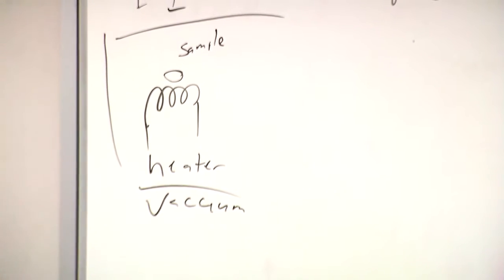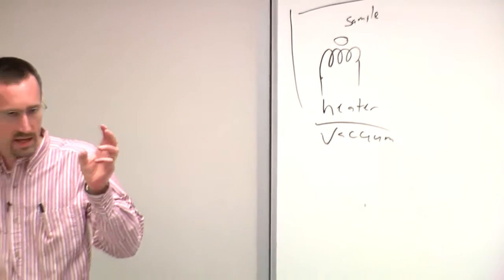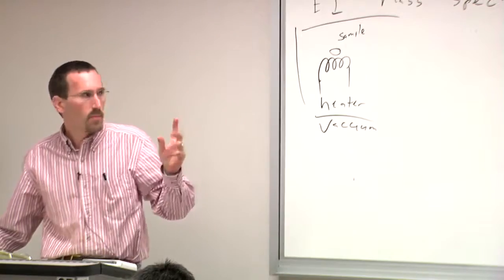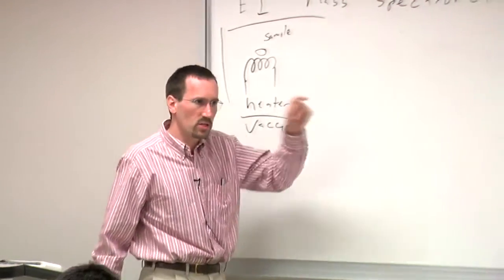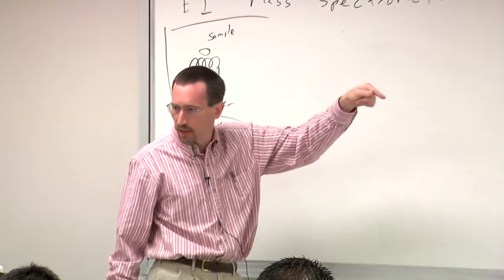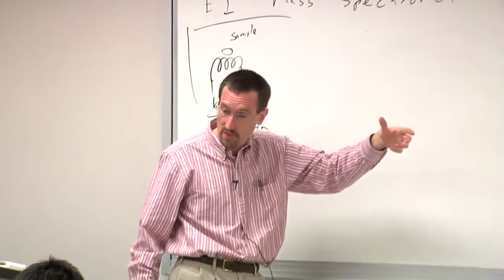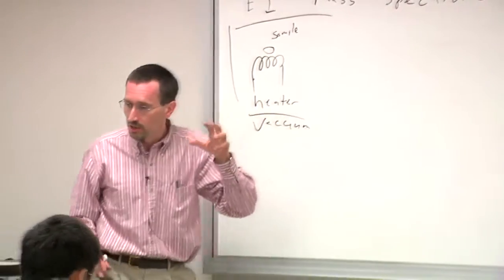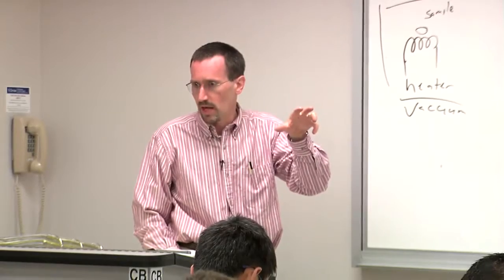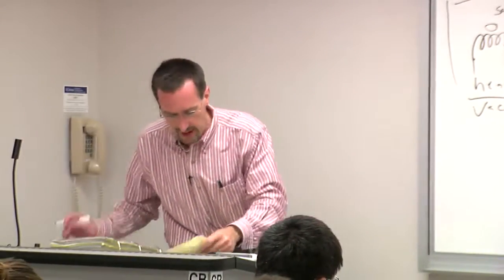And it's going to need to be a pretty good vacuum, at least by the time the molecule's flying along. The ionization part can have some pressure to it, but by the time the molecule is actually moving, you've got to have movement in the vacuum without it colliding into other molecules. In fact, one of the experiments that people sometimes do are collisional experiments where you're deliberately trying to stop the motion of the molecule, but short of those experiments, you need the molecule in a vacuum.